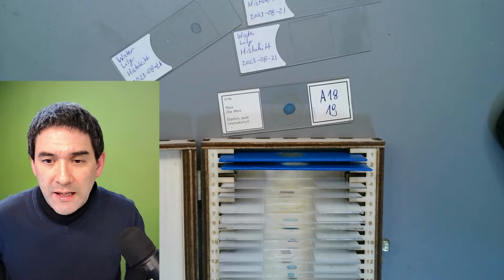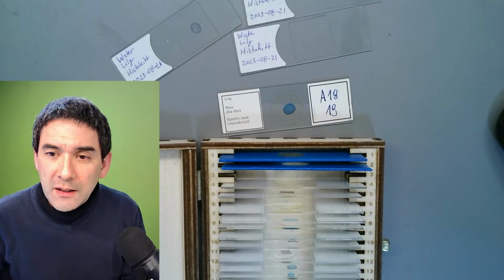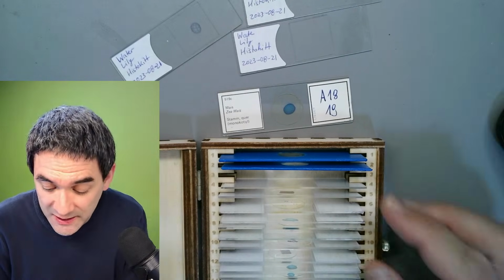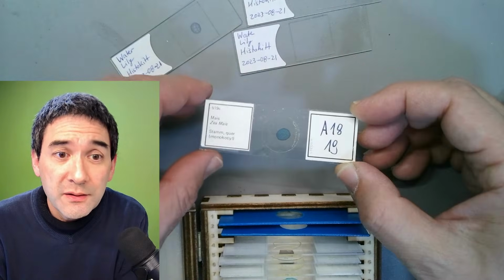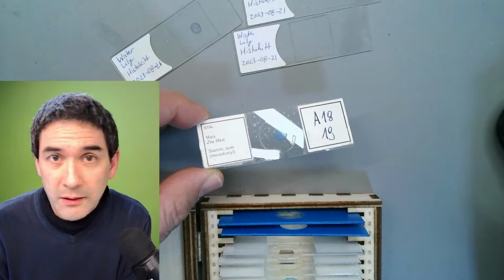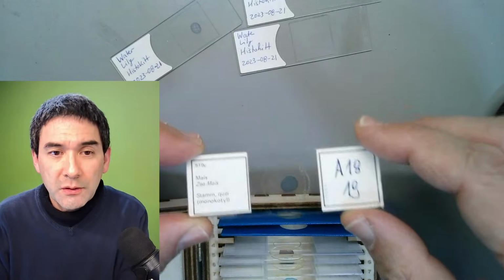It's lieder.de, a German company. You can download the slide catalog, and they even manufacture slides based on your own requirements. Some of the slides can be quite expensive, and if they don't have it, I don't know who's got it, honestly. So let's have a look at those.